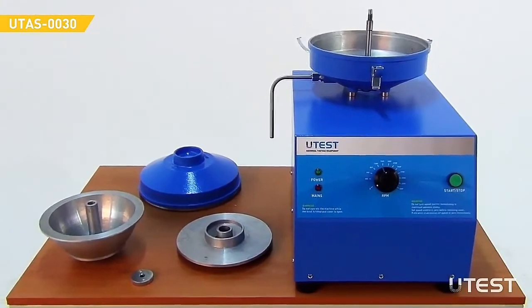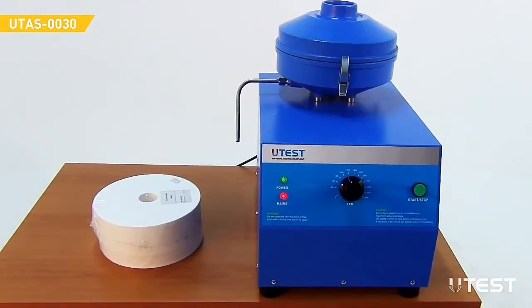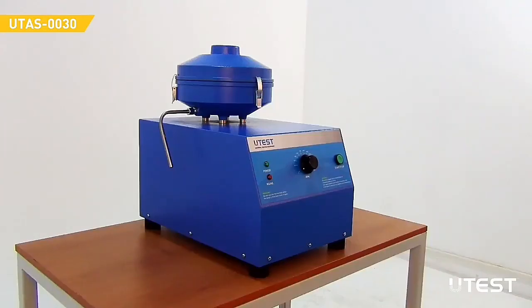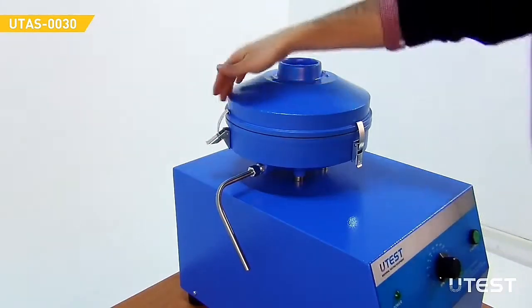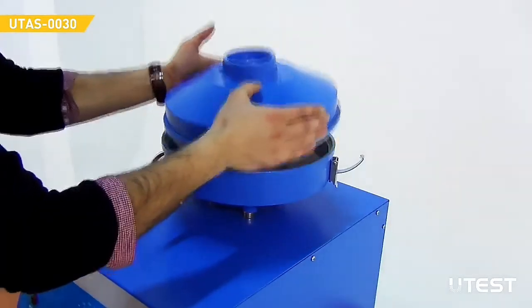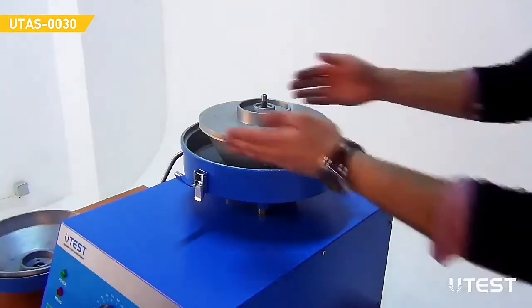The centrifuge extractors are supplied complete with 100 pieces of filter paper. The device should be seated on a solid bench. Release the fasteners to remove the cover, then remove the centrifuge ball.